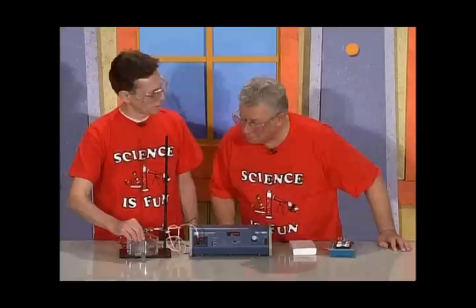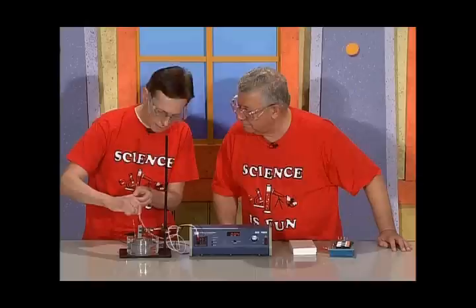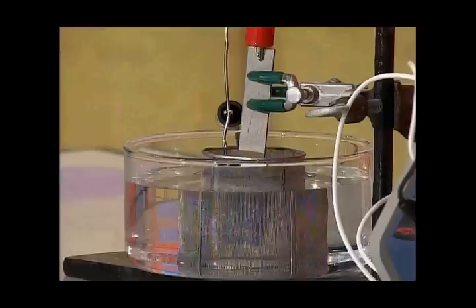Yeah, let's try different voltages. I'll clamp it in again and connect the positive to the niobium. There, that'll do. So the voltage has something to do with it? Well, we'll find out. Okay, I've turned it up a little bit, and I'll turn it on. I'll give it a little time. It takes a little time for the coating to appear. And then I'll turn it off. I'm going to try several different voltages, and I'll move it up each time so that I expose a different part.